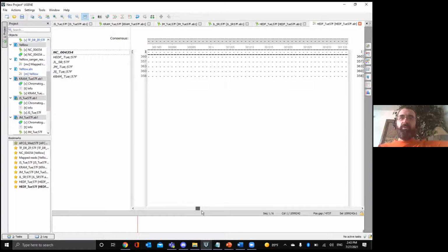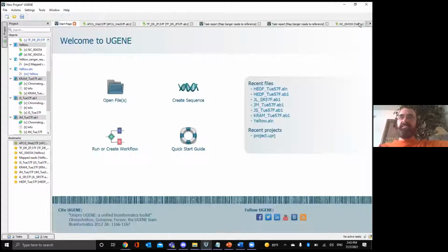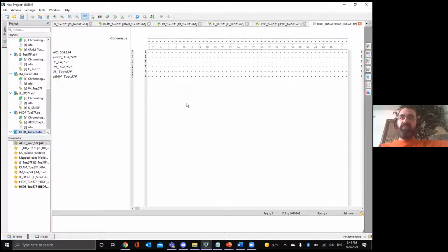Okay, all right, close that window out. There's no undo button. Go back to your objects box and then scroll down to the bottom. Okay, click on that. Double click on it. Nothing. But there is some.